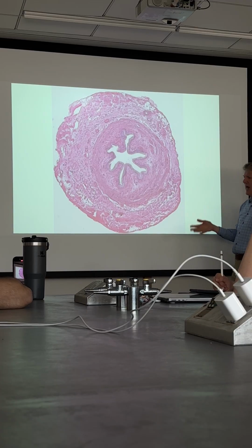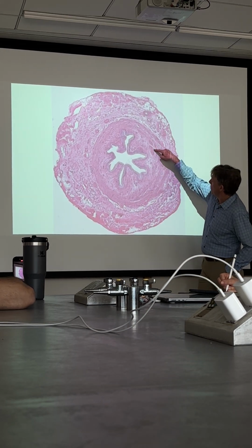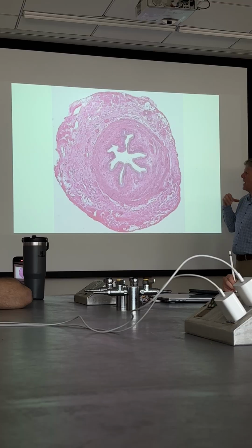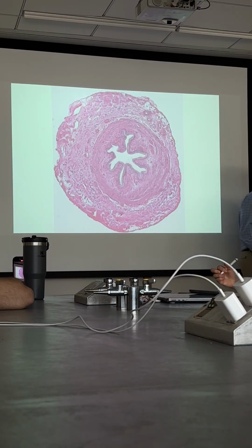And that's just the opposite from what you saw in your digestive system. Okay, so it's flipped around like that. So some of these layers out here would be circular. Some of the layers that are a little bit deeper in are going to be longitudinal. Okay, all this other junk that's out here is like adventitia. It's just kind of holding the ureter in place. But this is the ureter proper. The rest of it's just kind of anchoring it in place.